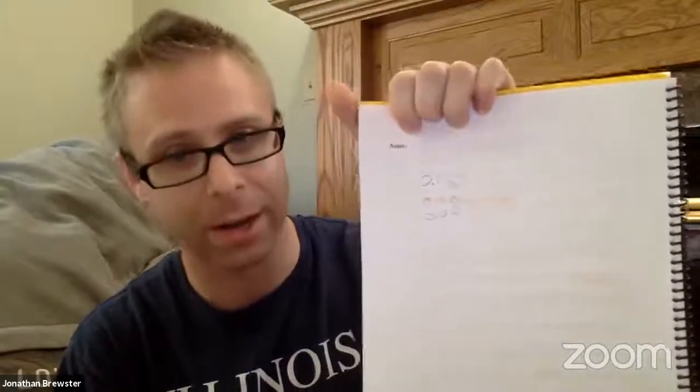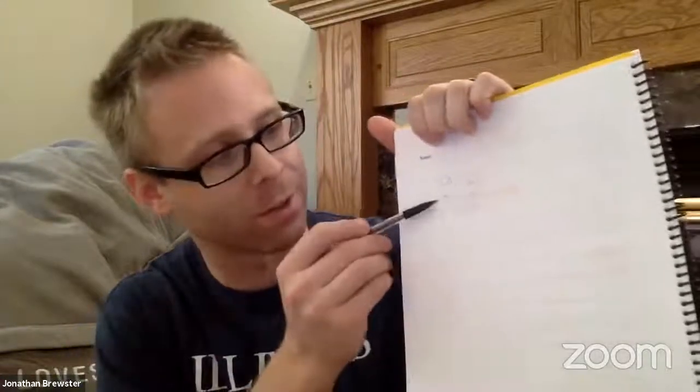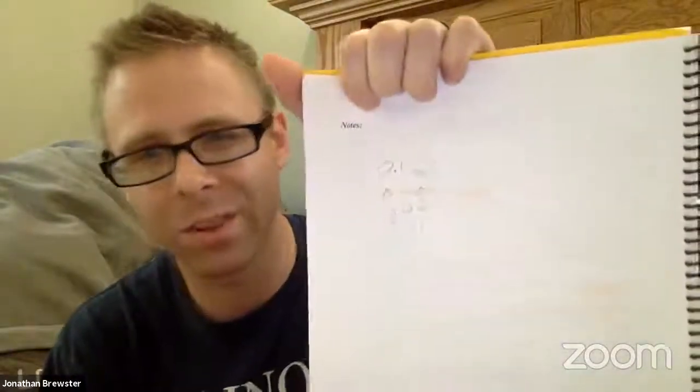And again, that just comes down to the fact that this is the uncertain digit here. And we're just going to go with the recommendation to stick to the 0.05. I've also done it where you just round it to whatever you think it is. If you think it's a third of the way past the mark, then you'd put a 0.3 there or whatever.